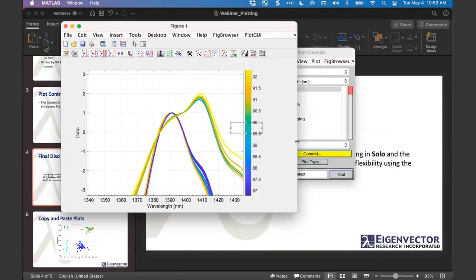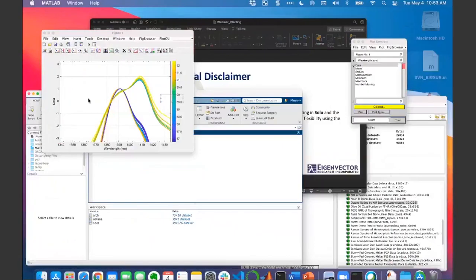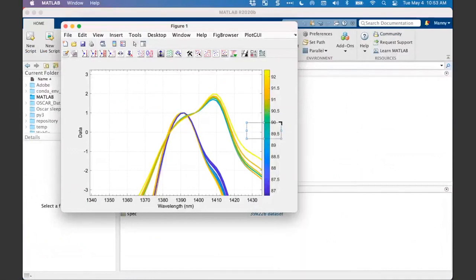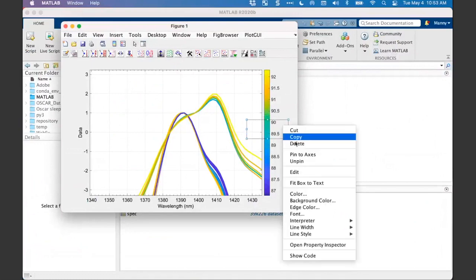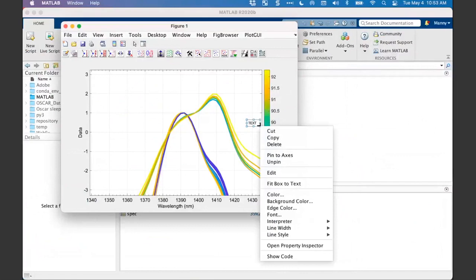Yeah, and you can rotate those. Just right click on them. Right now it's winning. Yeah. So in theory I can resize this. Just double click in there. Yeah, I don't know why it doesn't want to. Oh, there you go. Text. Yeah. And then you can right click on it and you can change its rotation, its font, and all sorts of stuff. Oh, got it.